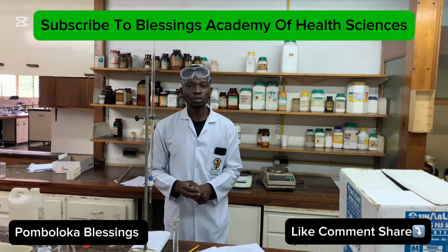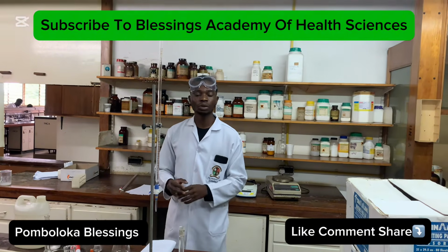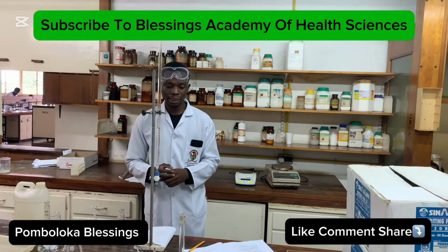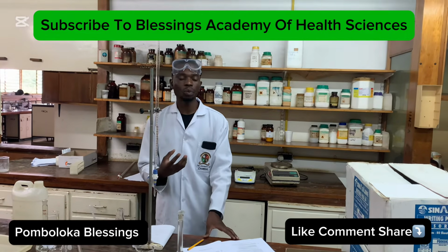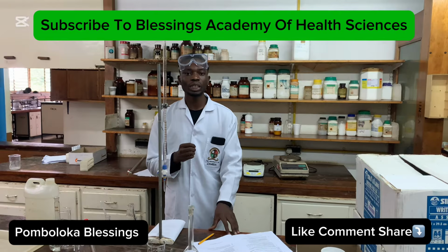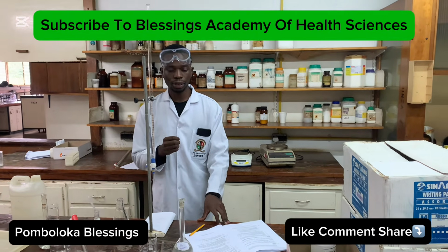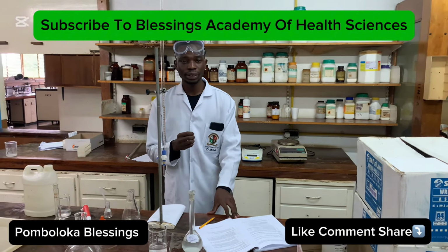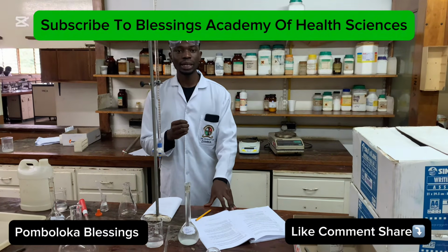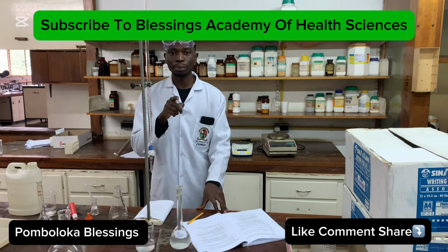Now, remember the first part of the reaction: the ammonia was reacting with the HCl to give us ammonium chloride. In the first part of the reaction, we're given the concentration of the hydrochloric acid and the volume of the acid, but the concentration of the analyte, which was the ammonia, was not given.